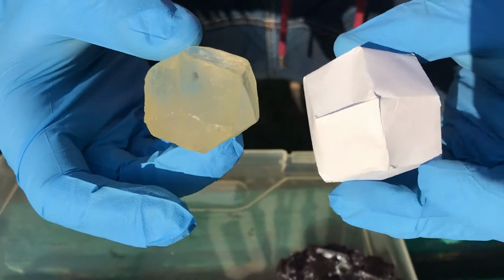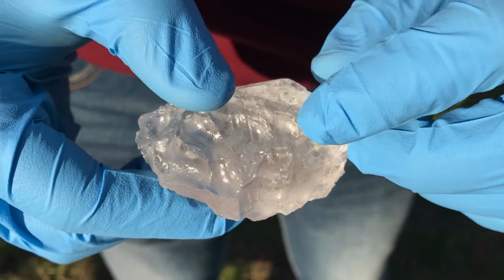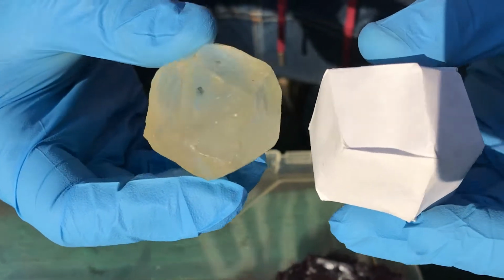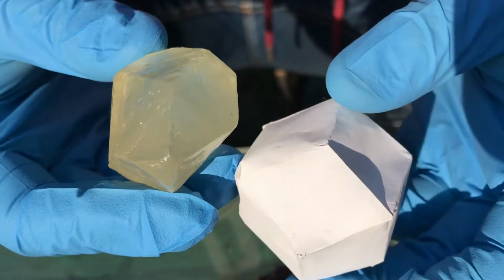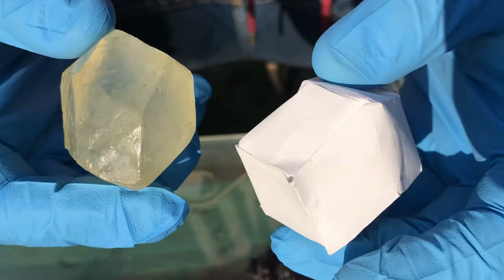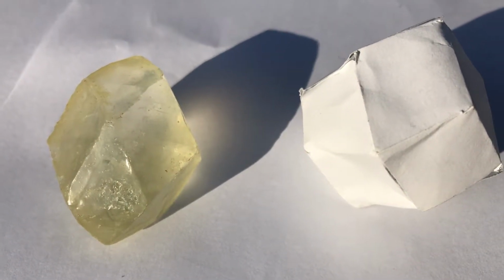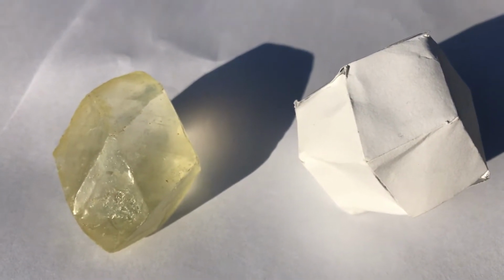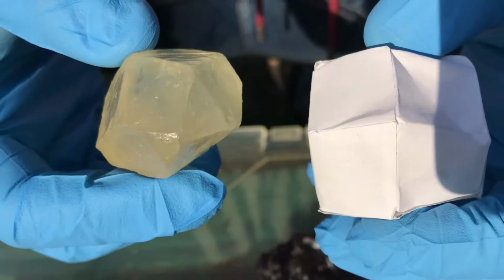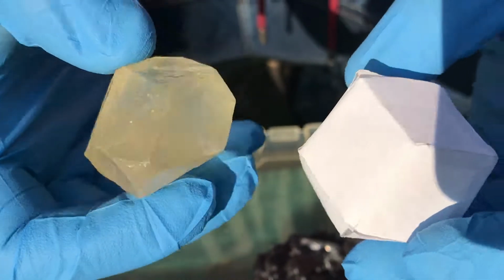The proper crystal should be transparent and have the form of a rhombic dodecahedron, although the yellowish crystal has such color because after growing it was not stored properly but placed near an unsealed ampule of iodine. After time, the iodine was sublimating, and part of the iodine vapor deposited on the walls of the crystal. However, its shape didn't change and is similar to the real geometrical shape of the crystal.